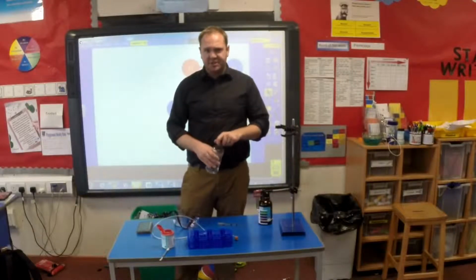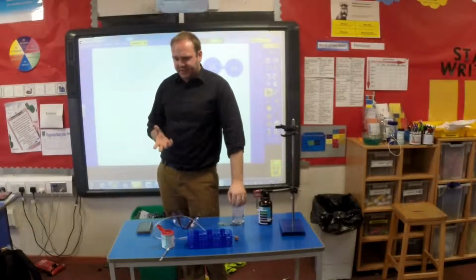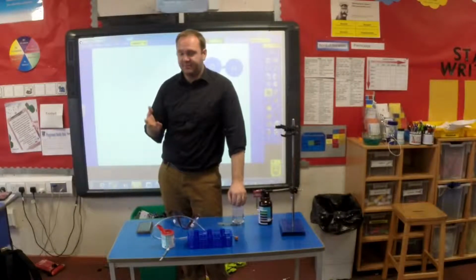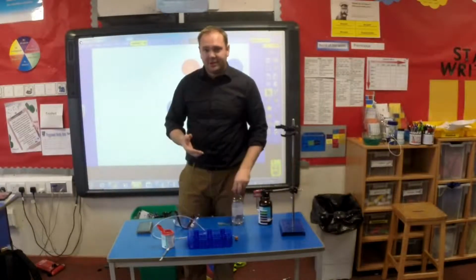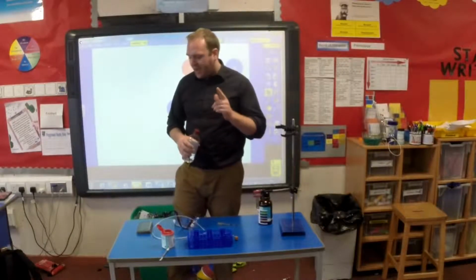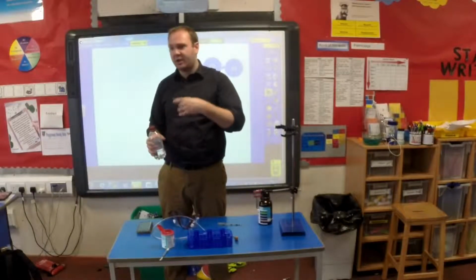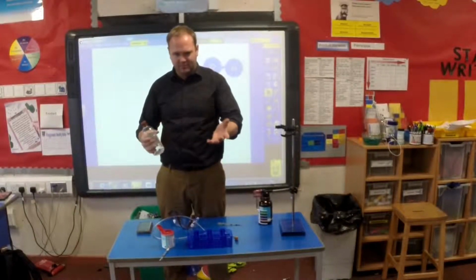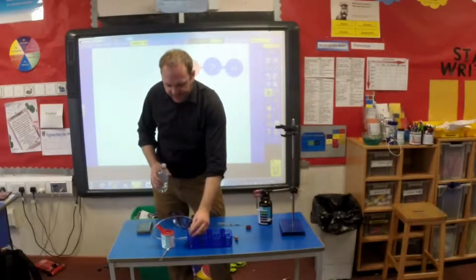So this ticks any experiences and outcomes to do with chemical reactions, to do with the mixing of substances to produce a new substance, but also anything to do with perhaps current affairs through the likes of global warming, climate change, acid rain, all that sort of stuff. So this is a chemical reaction, but the learning point from it is to do with the environment. I usually do it as a demonstration to the class, because I tack it onto the end of the acids and bases one, but there is nothing to say that you couldn't do this as a whole class experiment, and have all of them participating in it.